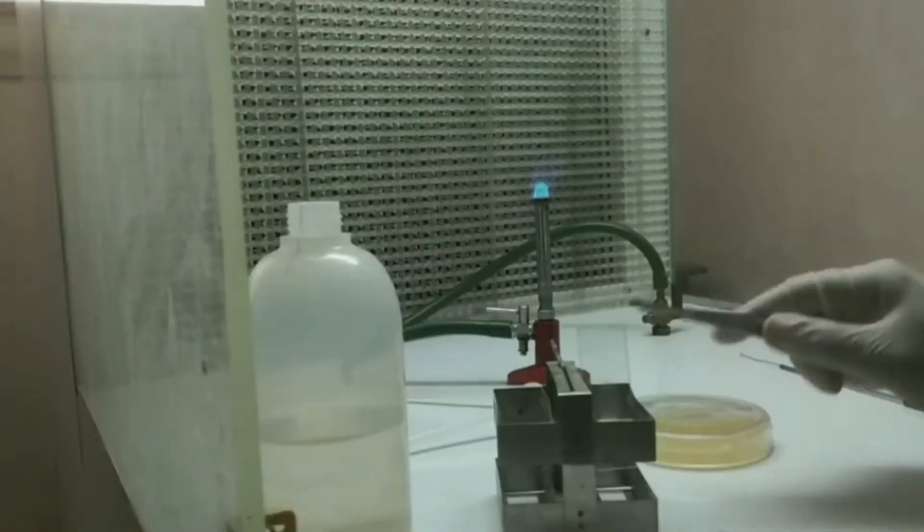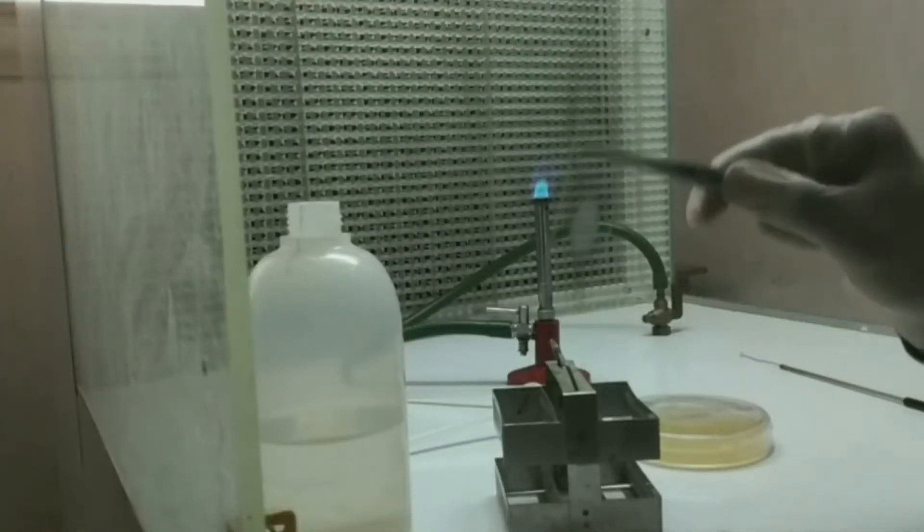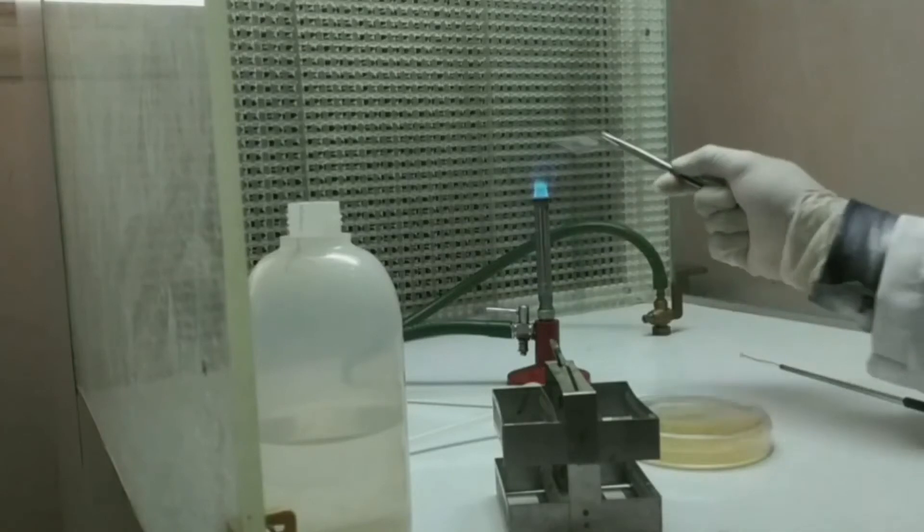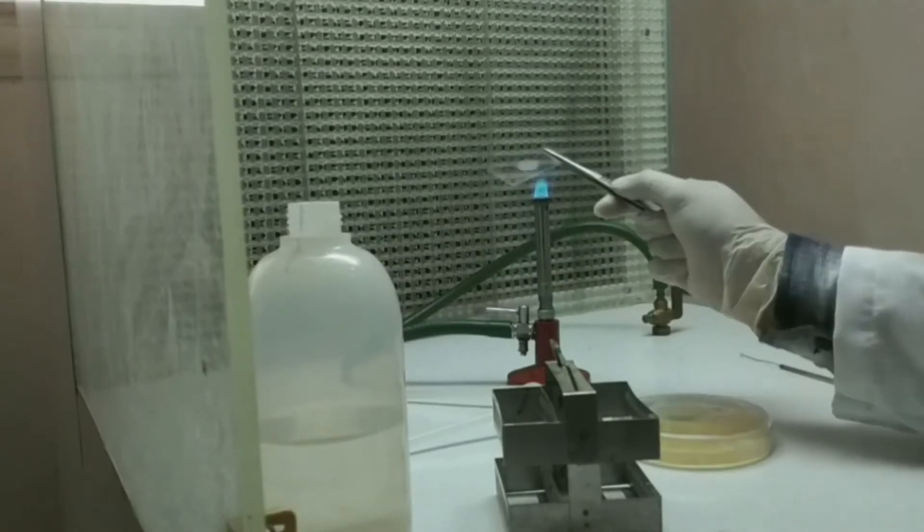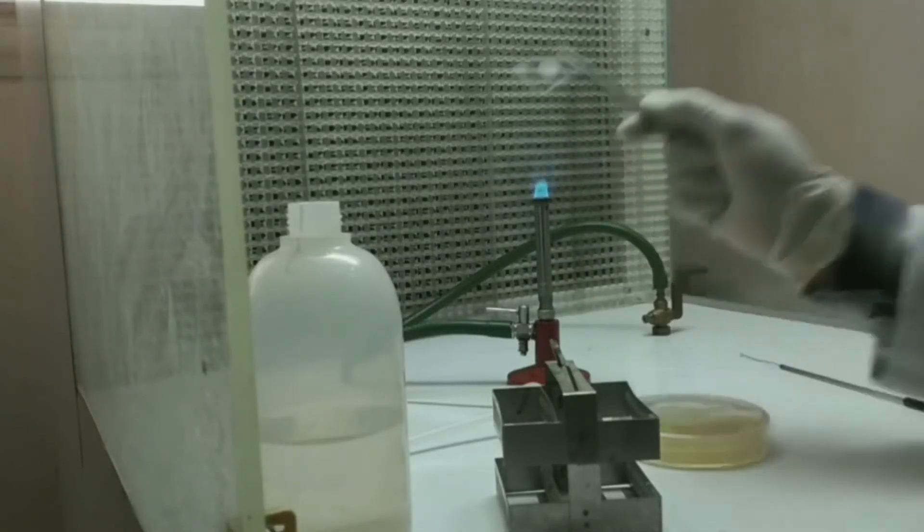The procedure is as follows. First, we have to make a smear. After that, we have to properly heat fix it so that the bacteria will adhere on the surface of the glass slide.